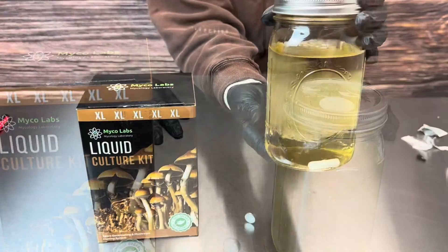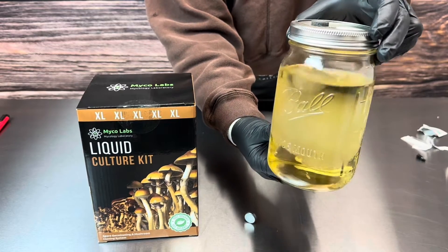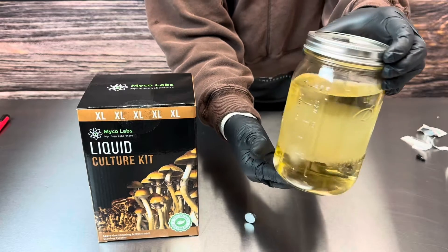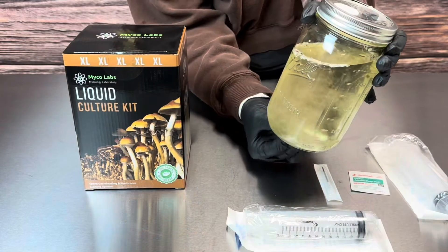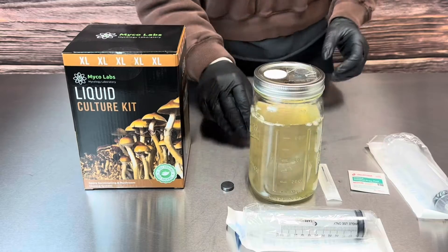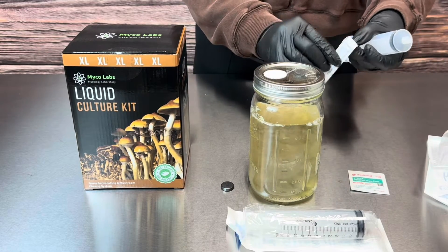After sitting for a while, this is what the liquid culture will start to look like — this is your mycelium growing. Once your liquid culture is ready, give it another stir, and then we're going to draw up some of the liquid culture using the 60 cc syringe.